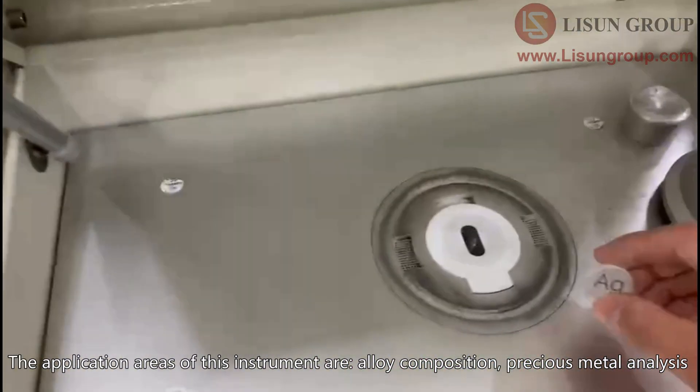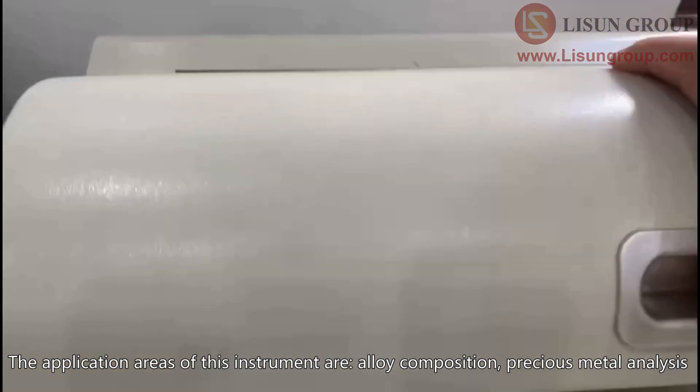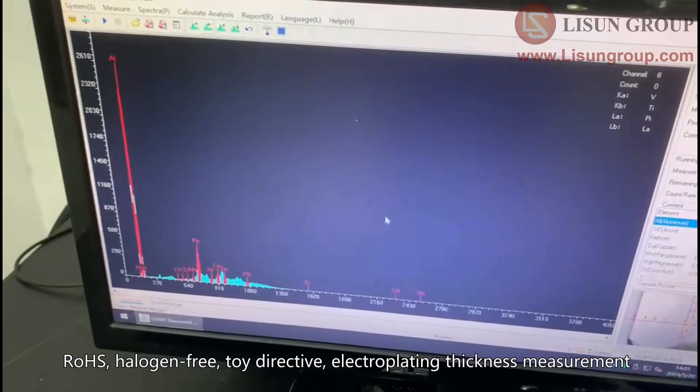The application areas of this instrument are: alloy composition, precious metal analysis, RoHS, halogen-free, toy directive, and electroplating thickness measurement.